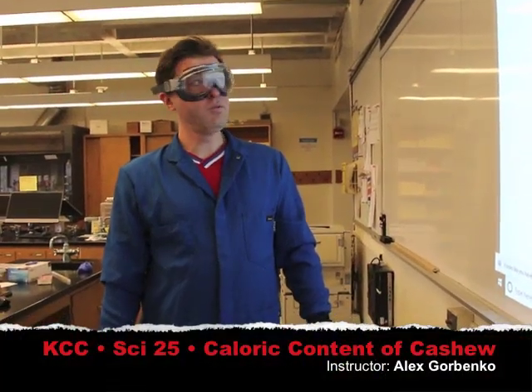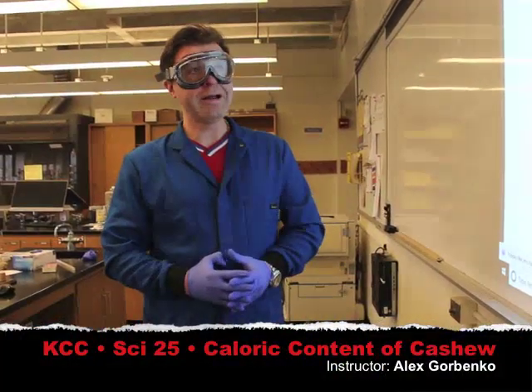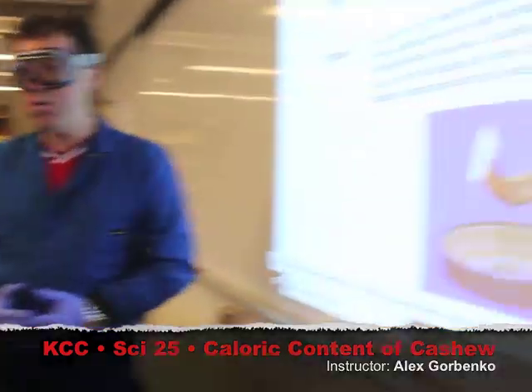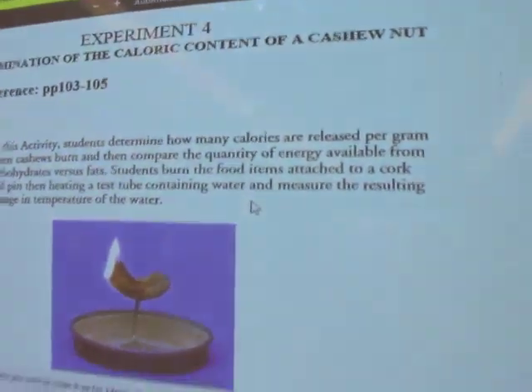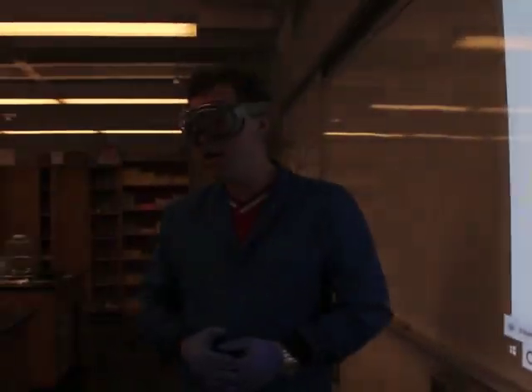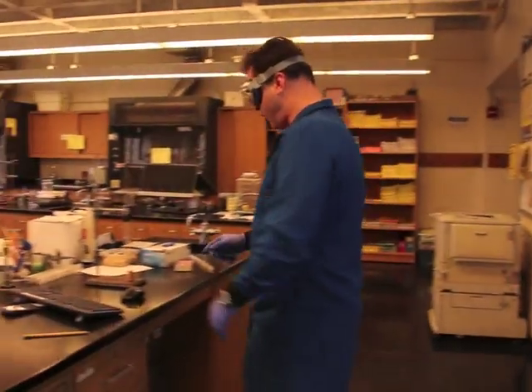Alright guys, in this experiment we're going to determine the caloric content of a cashew nut. The way we will do it is we're going to use a very primitive calorimeter where we're going to burn this nut.